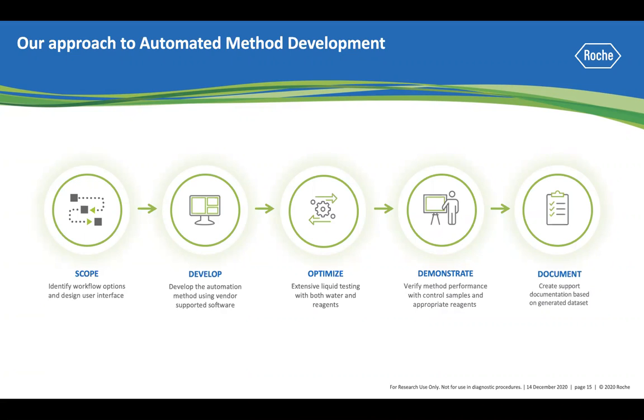Some platform software functionality does include the ability to simulate a live run. So after we believe the script to be complete, we would be sure to simulate all options included in the standard workflow so that we don't get stuck troubleshooting script bugs later when we get to wet testing.